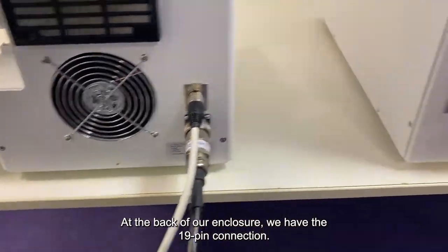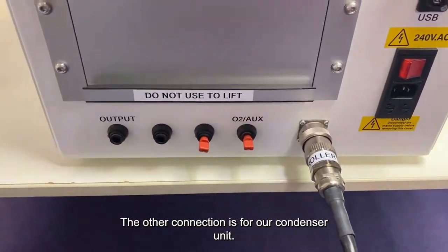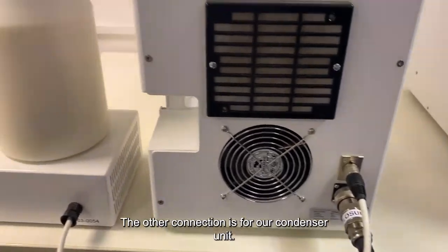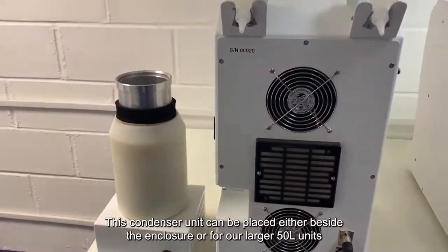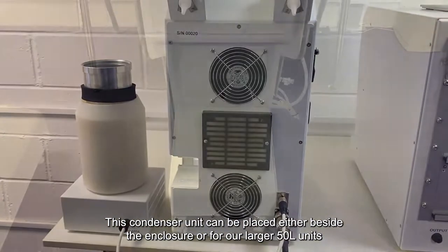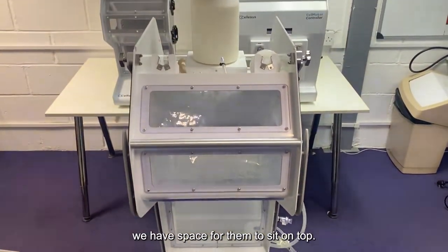At the back of our enclosure, we have the 19-pin connection, and the other connection is for our condenser unit. This condenser unit can be placed either beside the enclosure, or for our much larger 50 litre units, we have space for them to just sit on top.